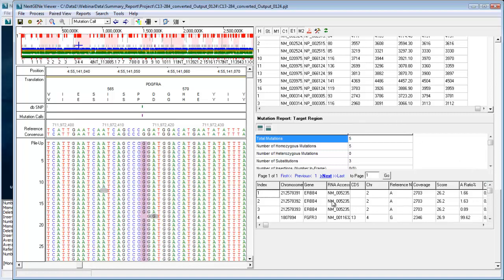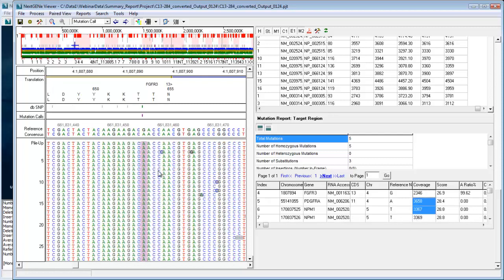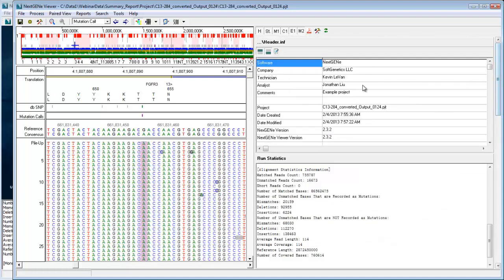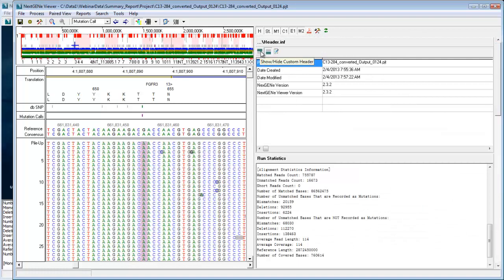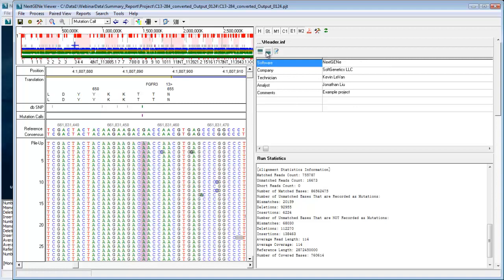So the summary report, if you click on any of the mutation calls, for instance, in the mutation reports, it'll jump to that location in your data set so you can see the pileup. So everything is hyperlinked to make things very easy to navigate. I mentioned that you can show and hide many sections just by clicking on the buttons in the header for each section.